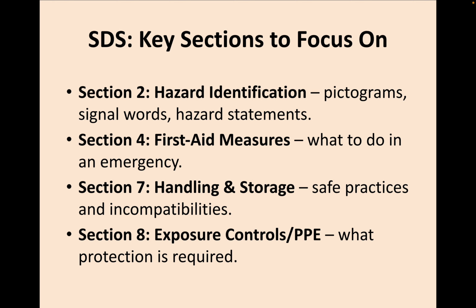SDSs should be easy to access in your classroom or lab. The hard copies are in binders in the stock rooms, but Googling the chemical plus SDS is usually the fastest way to get the information.